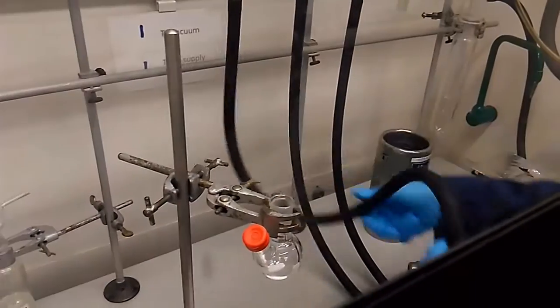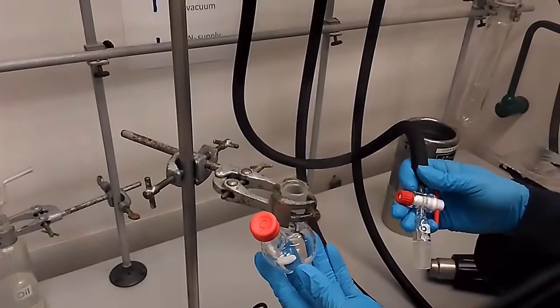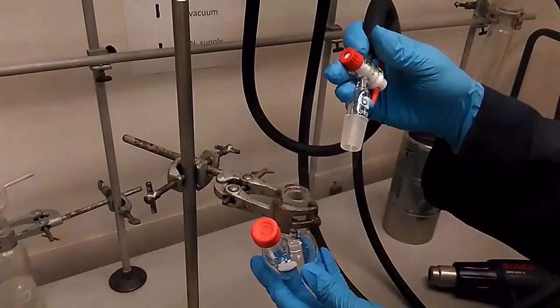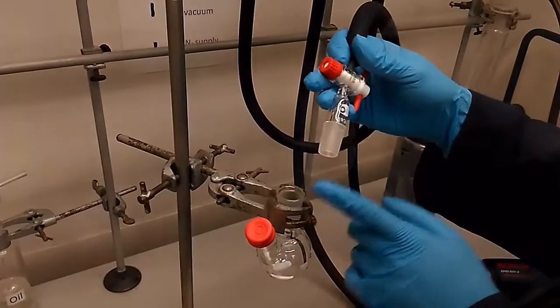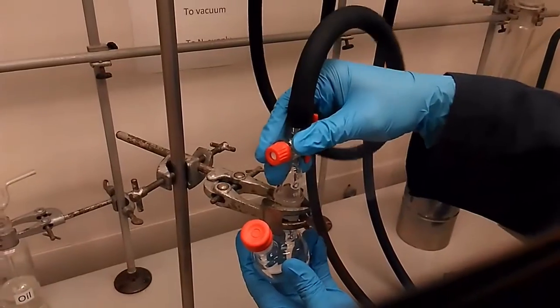We have the two neck round bottom flask with the stirring bar inside. And with one of the neck being secured with a rubber septum. And the other side, we're going to fit in with an adapter that connects to your Schlenk line.